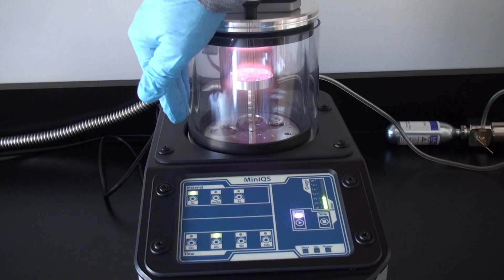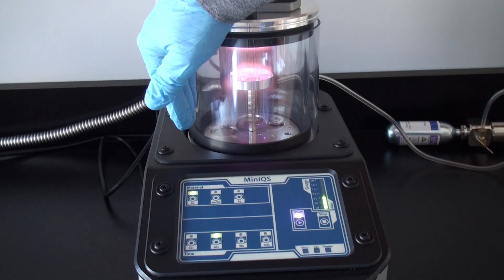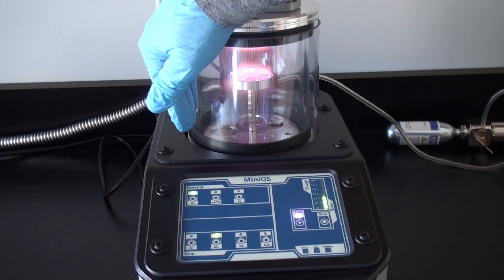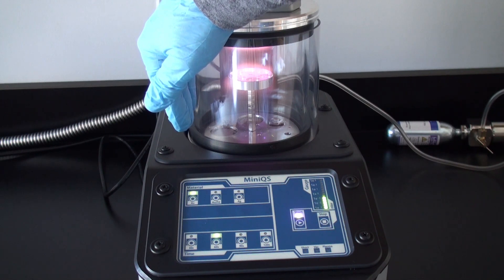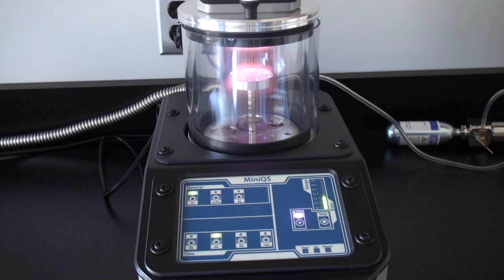it will start the sputtering process and ignite the plasma, as you can see here in the chamber. We have our typical gold plasma being formed, your samples are being coated for the specified amount of time, and then the system will automatically stop. This is a turn it on and forget system. It will complete the entire cycle all on its own without any intervention.